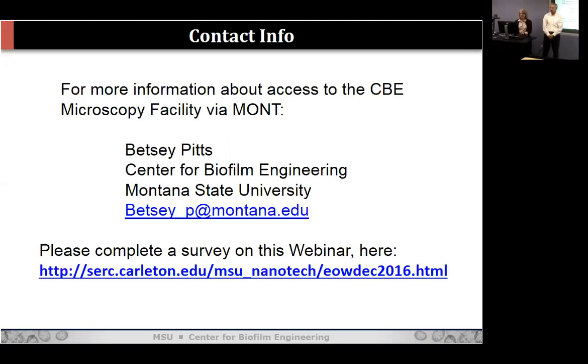You're welcome. Dave? A related question: if we were providing our own substrate and we wanted to match the thickness of the cover slip to your objective lenses, are there some standard thicknesses that are appropriate? That's a great question, yes. It's also written on our objectives: when there is a cover slip, the thickness is 170 microns. All of our objectives are corrected for that thickness, so that's the one you want to use.